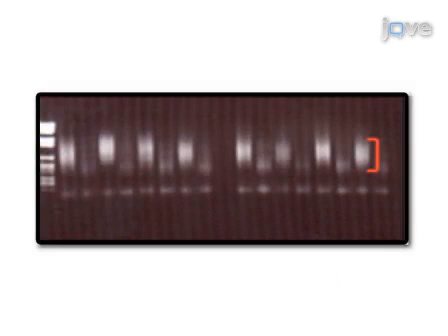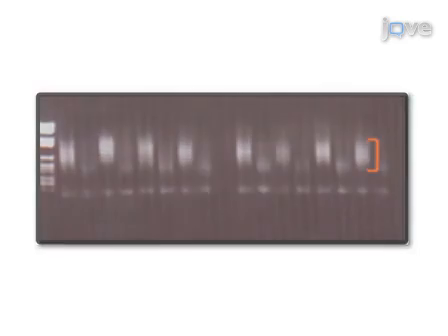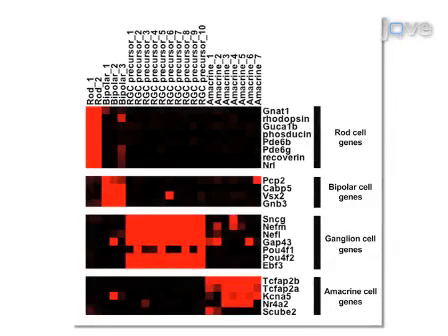Then the cells are lysed and the cDNA is amplified using reverse transcription followed by polymerase chain reaction. Ultimately, hybridization of the single-cell cDNA on an Affymetrix microarray is used to reveal the mRNAs expressed in a single cell.